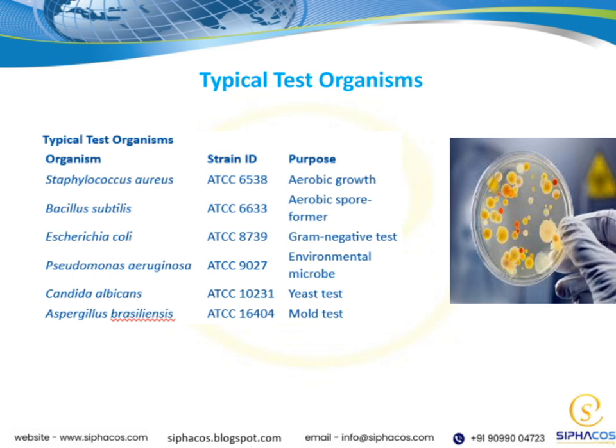By recognizing these organisms, we can better interpret test results and ensure accurate diagnoses. This understanding ties back to our overall goal of effective infection control and appropriate treatment strategies. Remember, knowing the typical test organisms is crucial for anyone working in microbiology or clinical diagnostics.